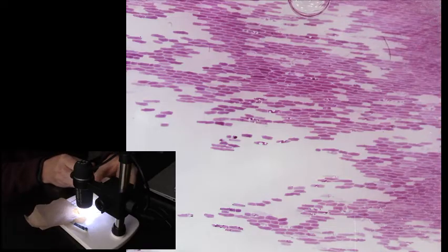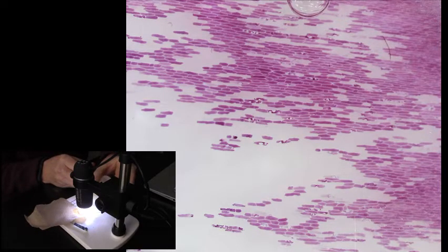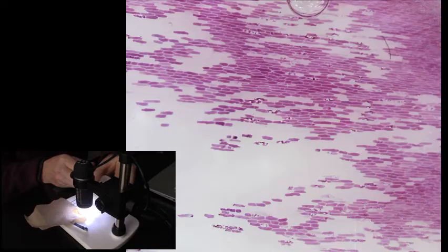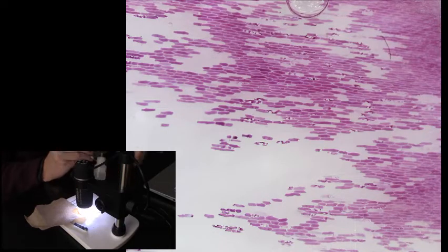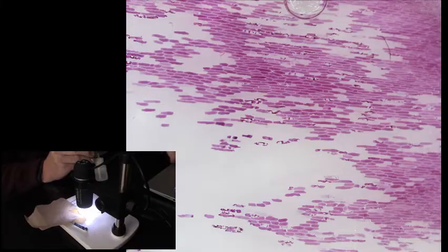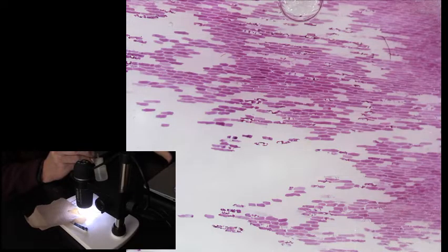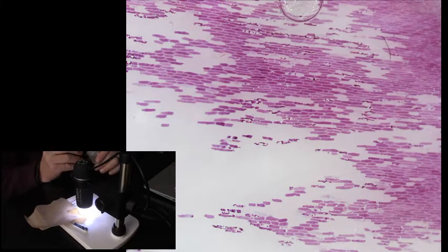Those little things that look like red bricks are actually the red onion cells. You can see the cell wall. That's a clear outline. And then you can see the red cytoplasm. It's tinted red with a pigment, not on purpose. That's the natural color of a red onion.